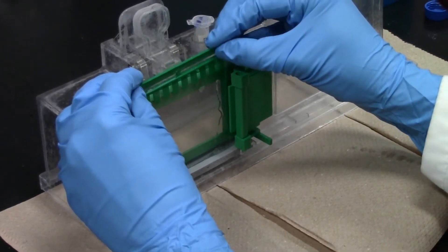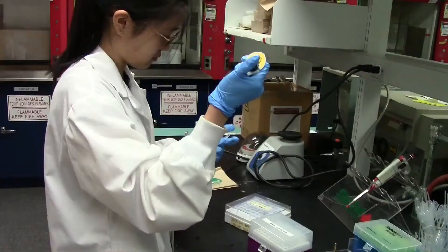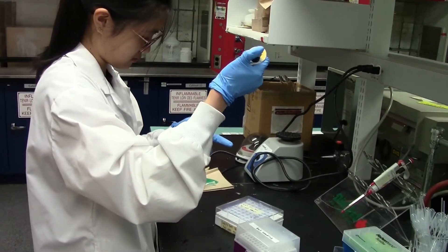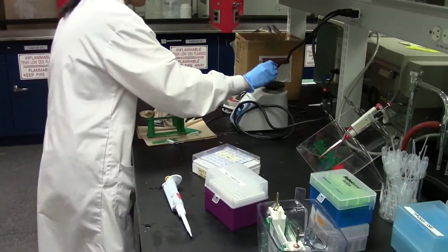While waiting for the gel to polymerize, you can prepare your oligonucleotide samples. 0.1 ODs are ideal for a small gel. Add 10 microliters of formamide to the dry samples and mix by vortexing.